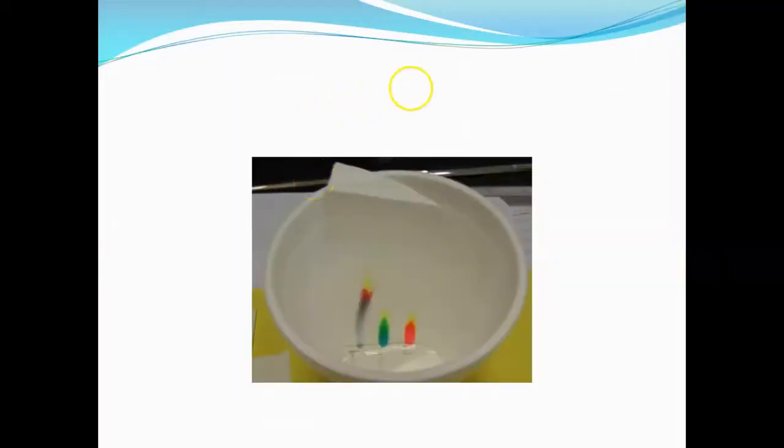This is the picture for the paper chromatography technique. Paper chromatography is one of our lab experiments. Unfortunately, we cannot do this experiment, but it actually takes quite a short time, within an hour only. In paper chromatography, we have a simple setup.